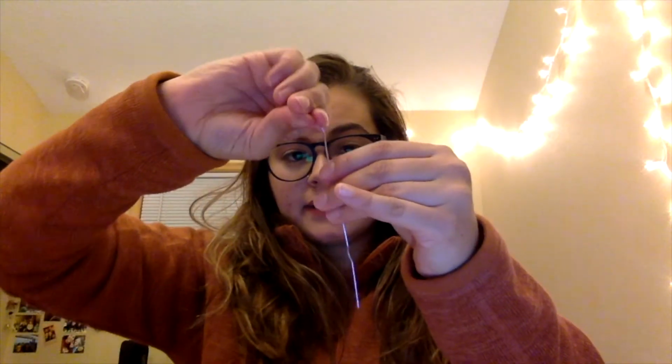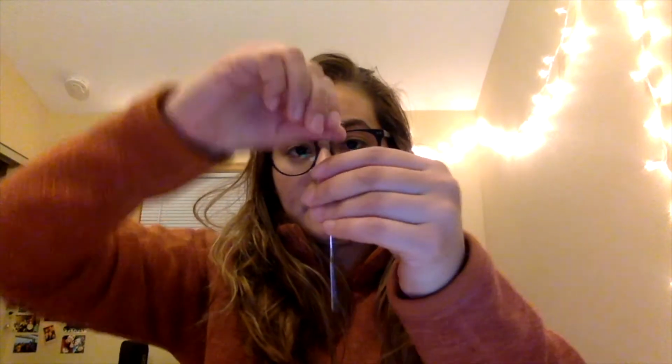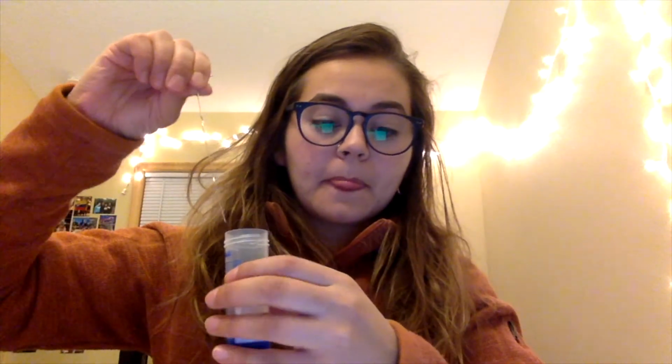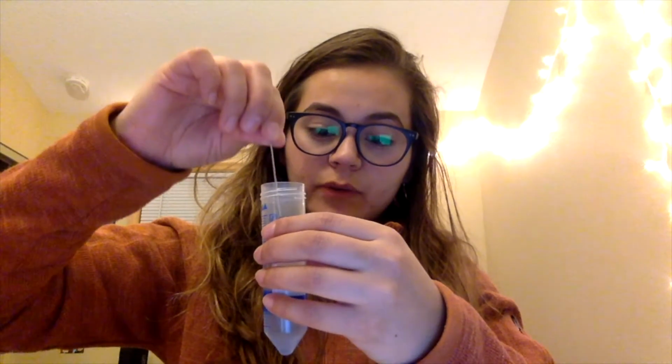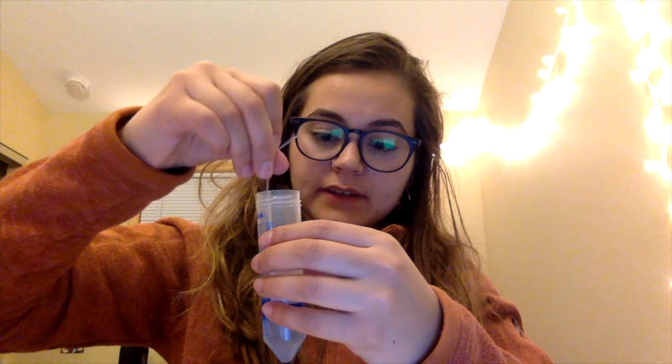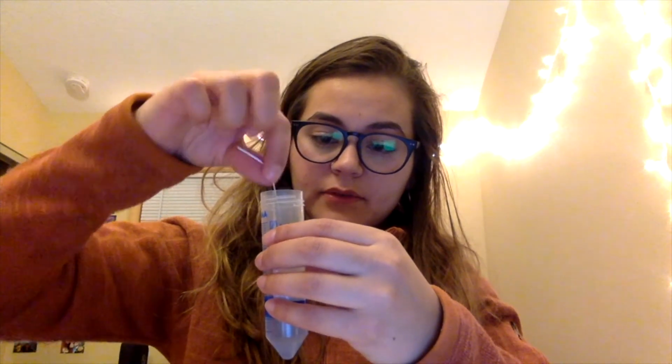our DNA. Okay, so I'm actually going to leave a little edge so that it's easier for me to actually hold it and twirl it. So you're going to take your tube, you're going to open it, and to collect our DNA, we're just going to go inside and just swirl really slowly inside our tube.